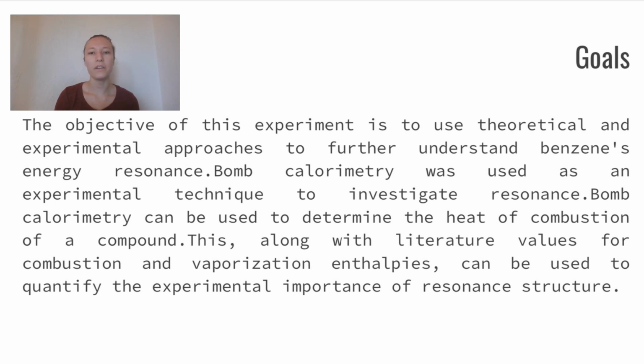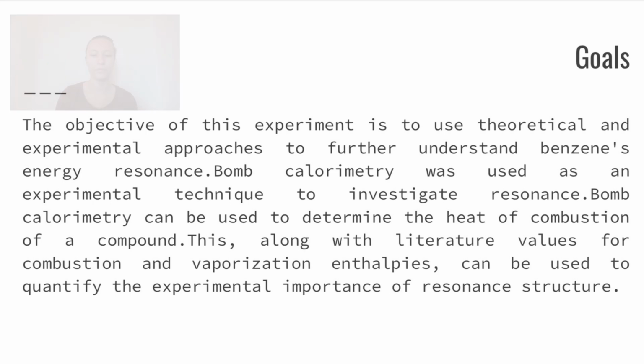Bomb calorimetry can be used to determine the heat of combustion of a compound. This, along with the literature values of combustion and vaporization enthalpies, can be used to quantify the experimental importance of resonance structure.